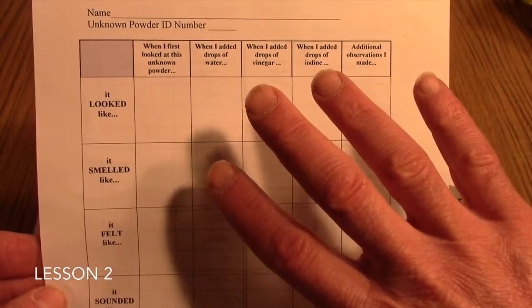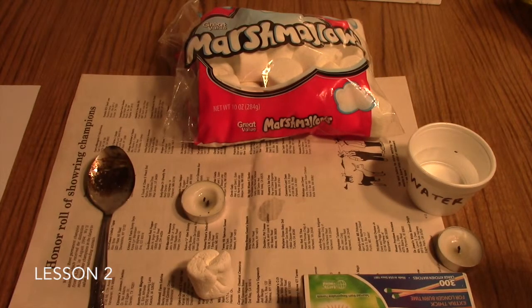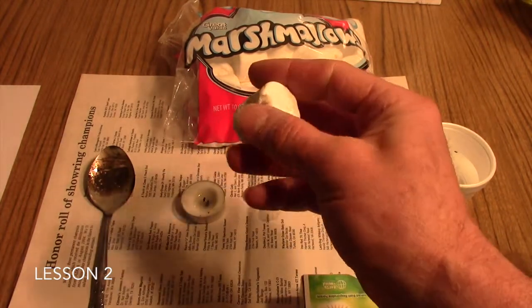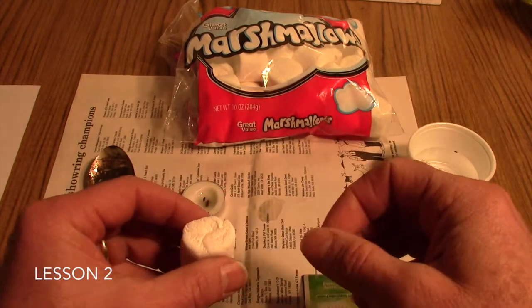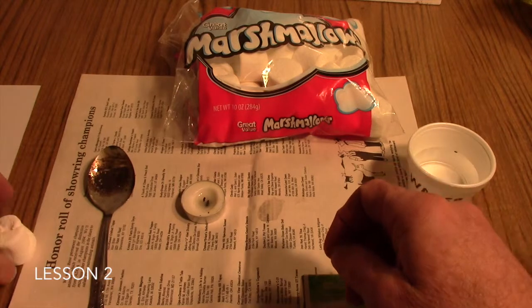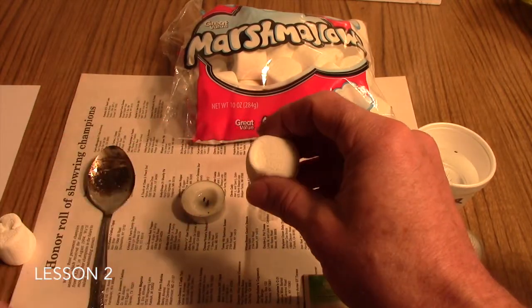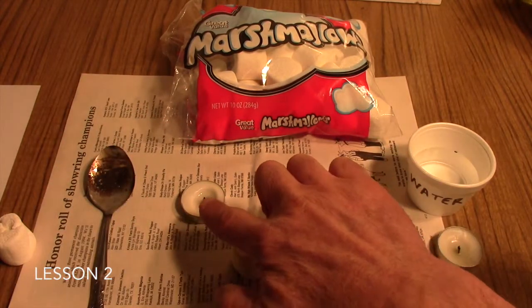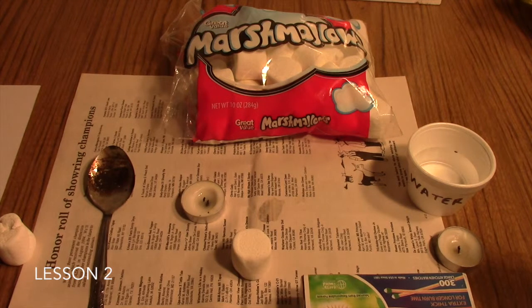You don't have to use the data table at all — you can just have them write their observations down on their own paper, or jot them down on your flip chart or dry erase board as you conduct the lab. After they've made their initial observations, depending on whether you do the lab as a demonstration or have students do it themselves, you'll then pass out marshmallows again. If each student is doing it themselves, make sure they're aware that there will be an open flame and that one must be careful and safe in lab activities.